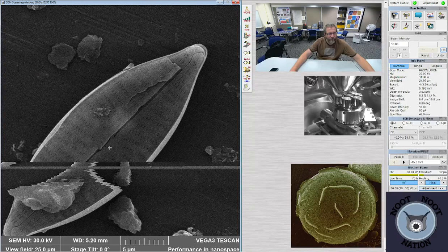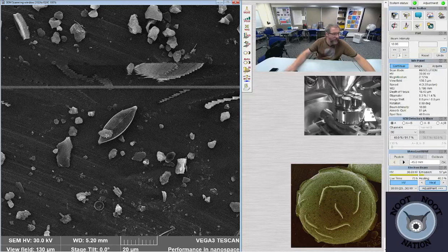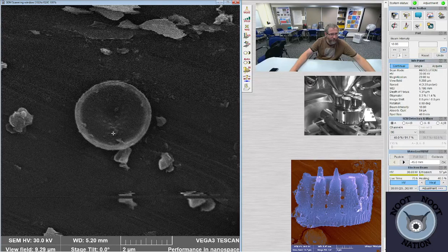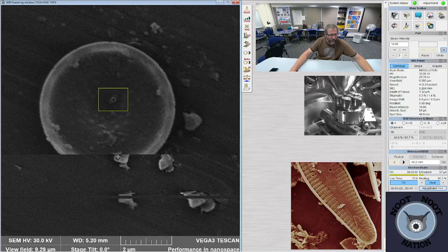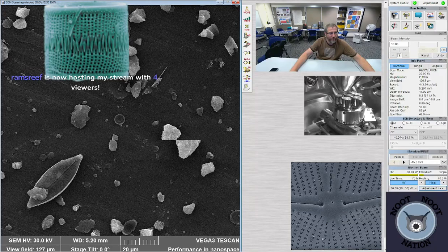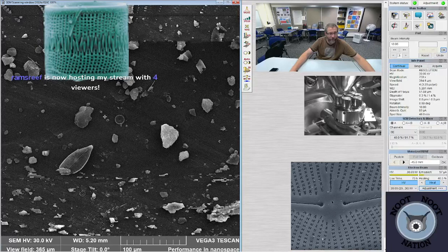And then I also spent the day in the lab earlier prepping some materials from the pond at my mom's house. So we should have some slides today or tomorrow from that as well. And then possibly Wednesday or sometime this week I may do a little SEM stream of the materials from my mom's and her neighbor's ponds. I need to first see them in the light microscope and see how they look.